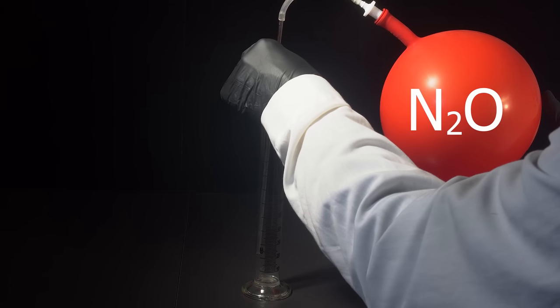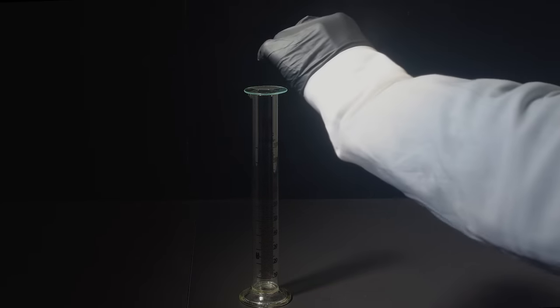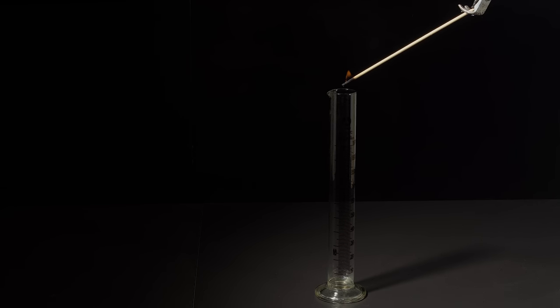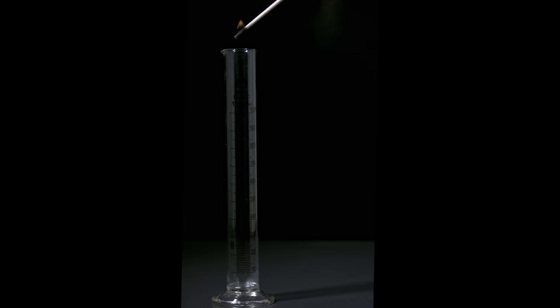It's then covered with a watch glass to let carbon disulfide and nitrous oxide vapors mix, and after all that the mixture is ignited. The sound that goes along the reaction resembles a dog bark, hence the name barking dog reaction.